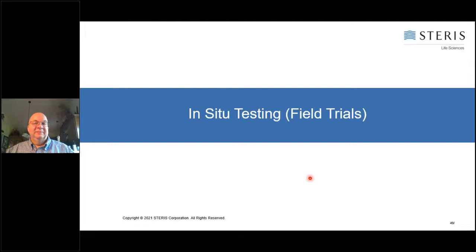So now I'm getting into one of the most important and critical topics that you can do, and that is the field trials, the in situ testing. This is really important when you look at, for example, what FDA regulators are looking for.